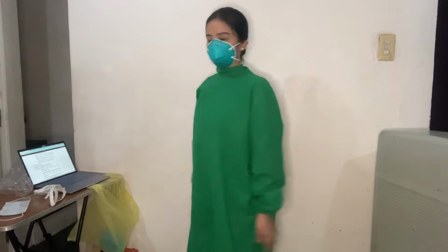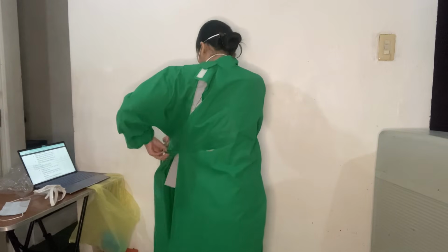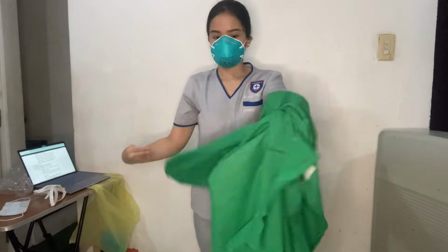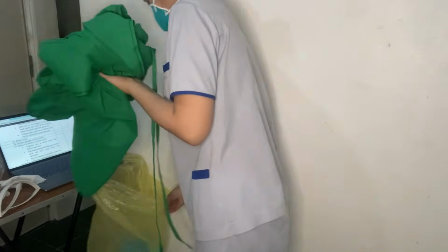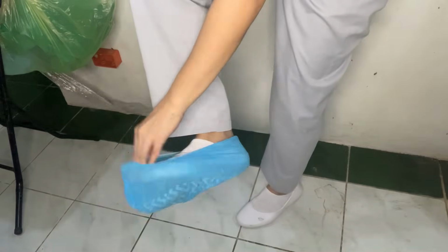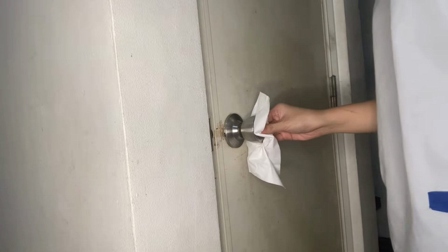Now we're going to remove our isolation gown. You're going to want to unfasten the ties at the lower back first before the nape area. Slip the hands underneath the gown at the neck and peel away from the shoulders. Remove the booties or the shoe cover. Leave the room, using a paper towel when holding the doorknob.